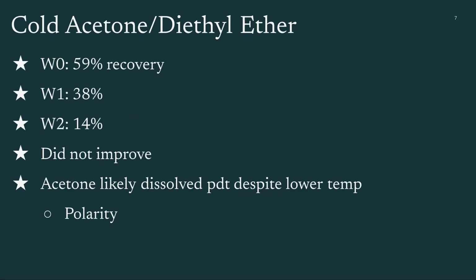Now for my results. First of all, for the solubility test, after running the reactions, we tested recovery using cold acetone and diethyl ether. Our week 0 with the original diethyl ether solvent, we saw a 59% recovery of the product, which we had originally thought was pretty low.